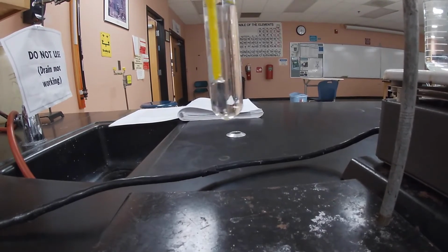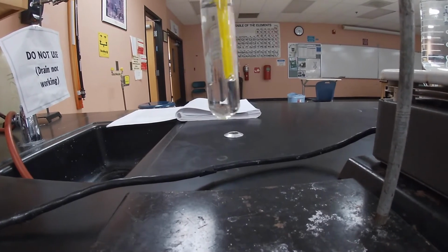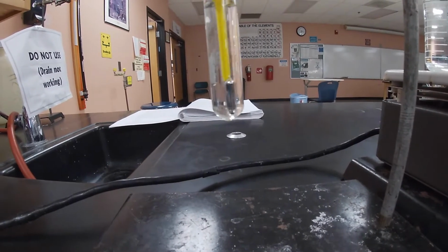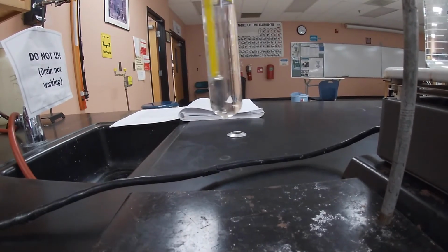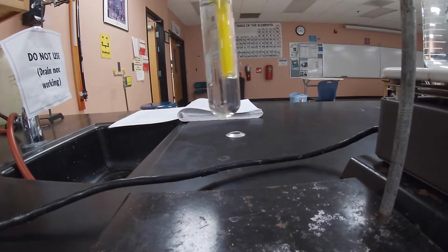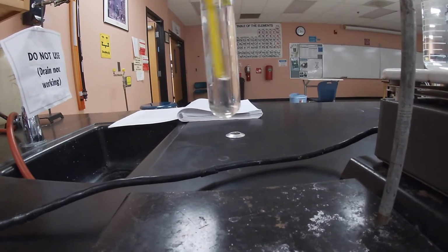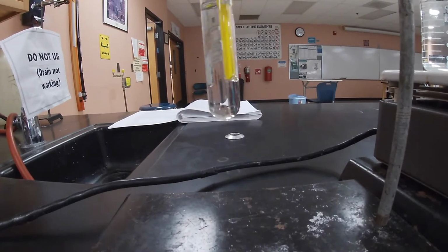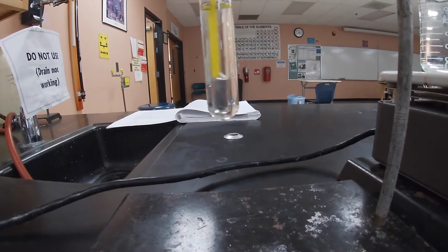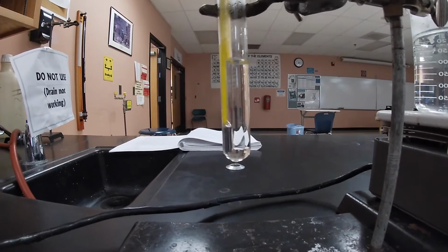It's coming close because we're at 58. At 57.